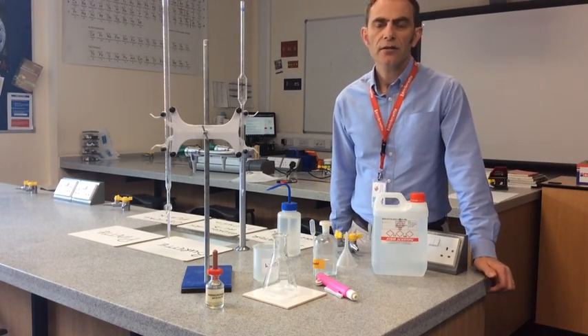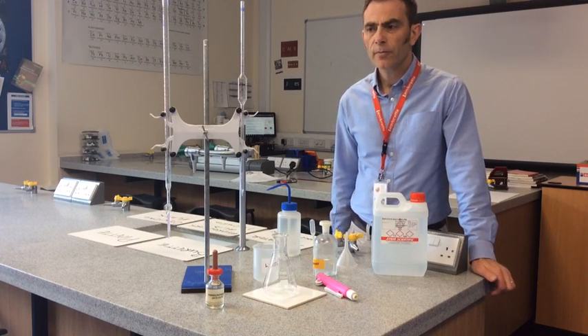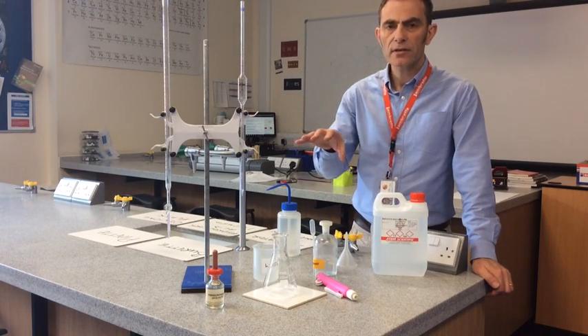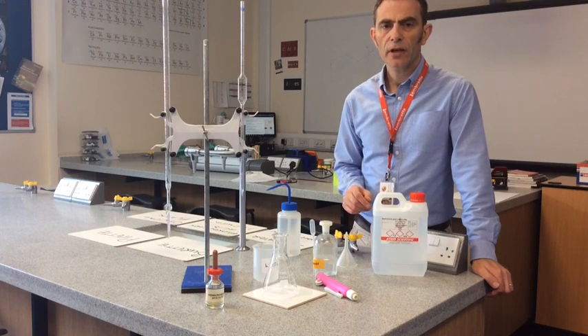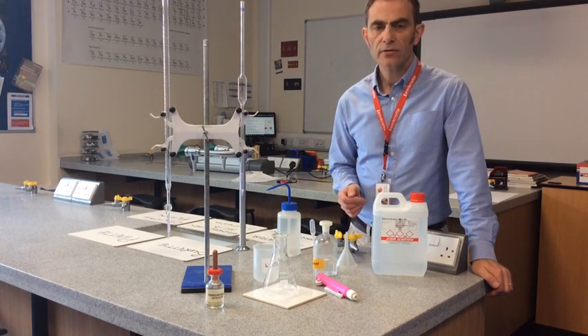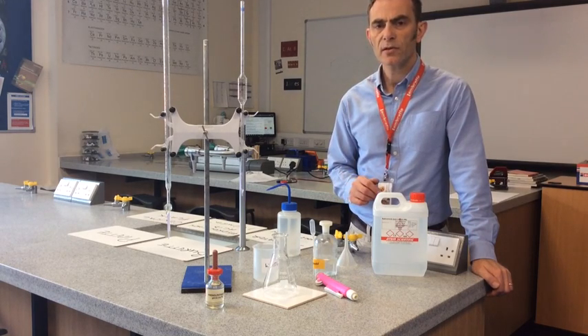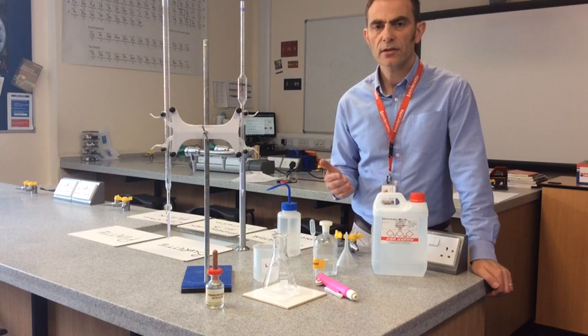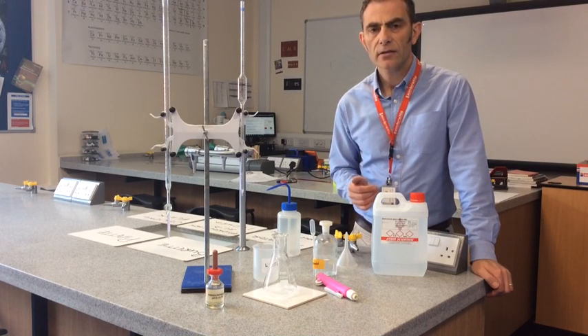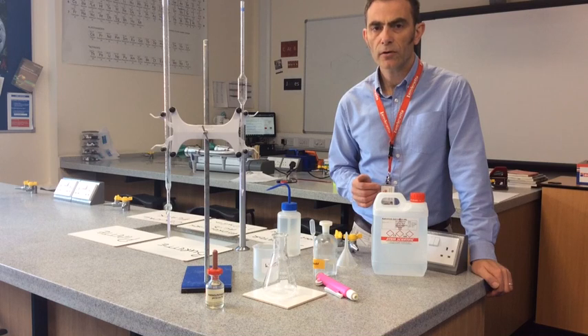In this video I'm going to look at acid-base titrations. I'll start off by pointing out all the essential pieces of apparatus, then I'll go into actually doing a titration and show you tips to get as accurate an answer as possible, and finally I'll look at a typical calculation and show you how to perform one.